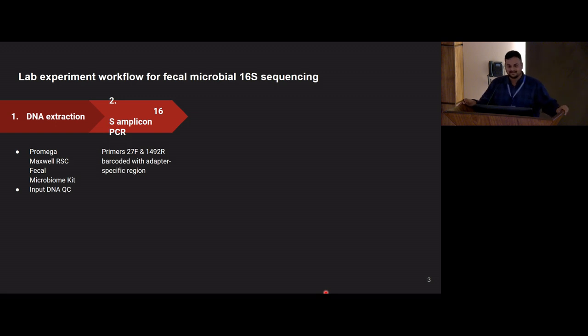Sorry? So I'll just put it out across. It's about 4.6 megabase pairs in E. coli. So if you want, again, Oxford Nanopore allows us to do these long read sequences, but we have time constraints and resource constraints and all kinds of other constraints. So we can narrow down to this marker region. That is what makes it more rapid.